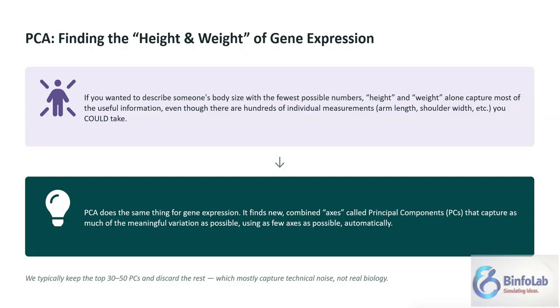This tool, or this analysis, is used almost everywhere in statistics, in different fields of biology, and also in physics and chemistry. The basic job of the PCA, no matter where you are using it, is to calculate the variance in fewer dimensions in an easy way.